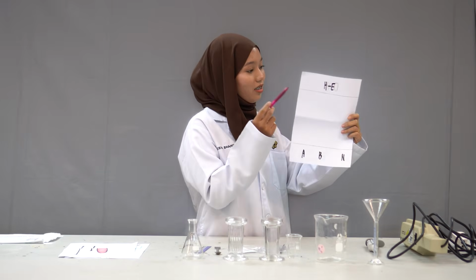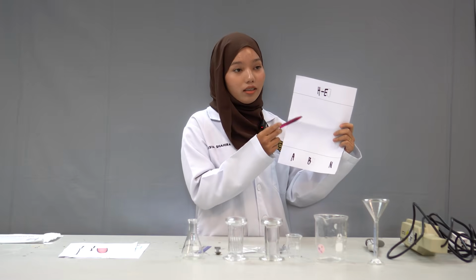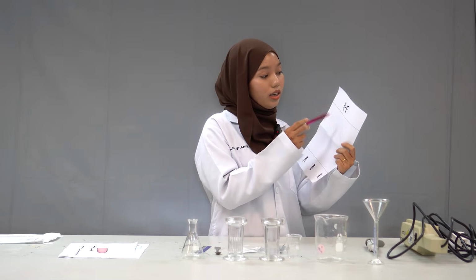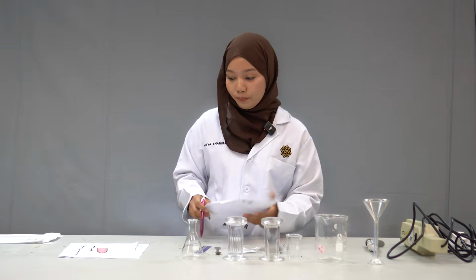After that, draw a line about 1 centimeter from the top of the plate for the solvent front. This is for the developing solvents, which are hexane ethanol, labeled as HE, and dichloromethane hexane, labeled as DH.